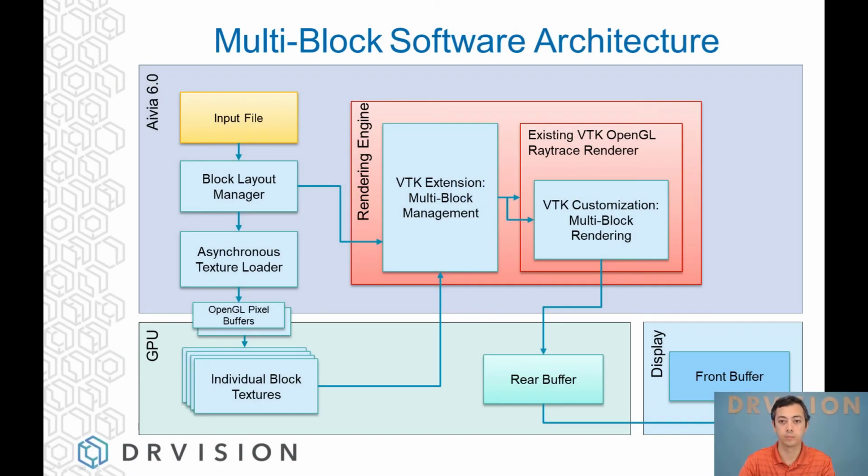One of the big problems, as Luciano said, was these really large data sets. A naive approach would be to just take your really big data set and downsample it. So you have a 30 or 50 gig data set, you can downsample it to 1 or 2 gigs and stick it on your consumer GPU that has maybe 4 gigs and view it just fine. But that'll look really terrible. Or you can cut off pieces like slices or cut out chunks and just look at those pieces, and that also works. But that's not quite ideal.